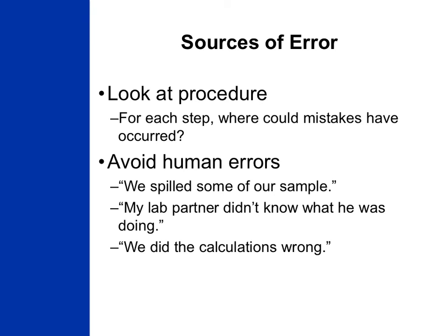All of these are preventable errors, which you will need to work on in the lab to prevent. When you go to write your discussion, you will need to include an analysis of your errors, including a list of 3 possible sources of error, whether or not they caused your yield to be higher or lower than expected, and state which one, as well as how you could prevent these errors from happening in the future.